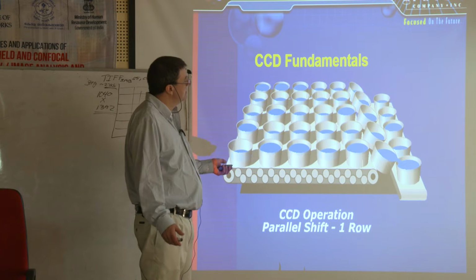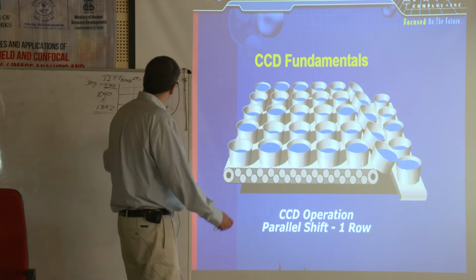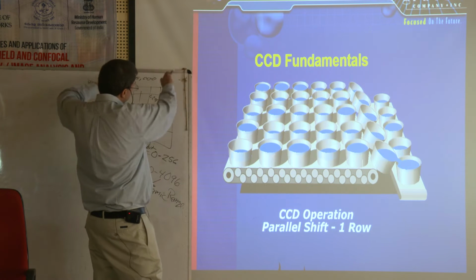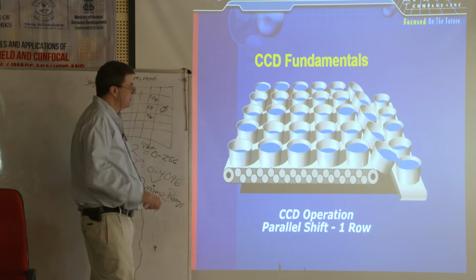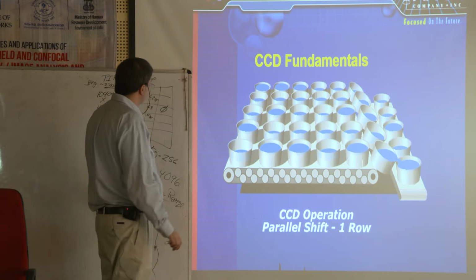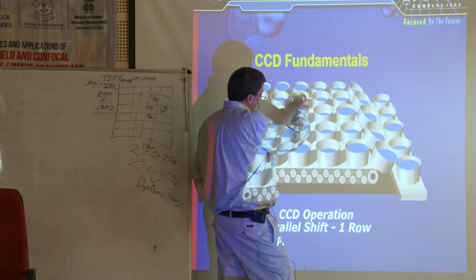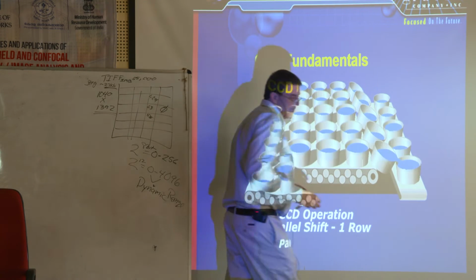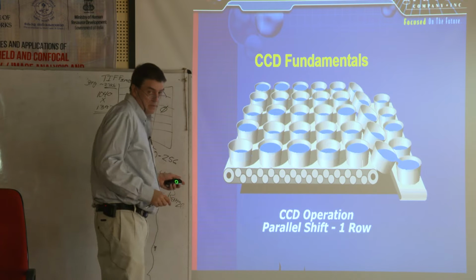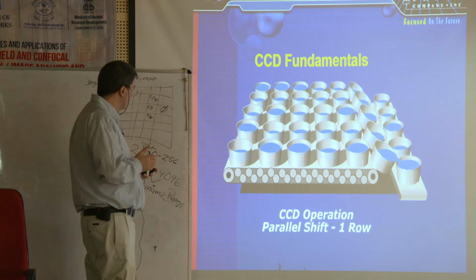Okay, so basically, I think Dr. Sinner talked on this a little bit yesterday about how it's all like buckets. So when you think of this here, you're just spilling water in buckets, photons in these pixel buckets, right? Which is represented here. So the way it works is basically you fill up the pixels, and then it takes a line of pixels, it changes to electrons, it dumps it out to the camera, and it generates the numbers, okay? And it happens super fast. We don't even realize it's happening.